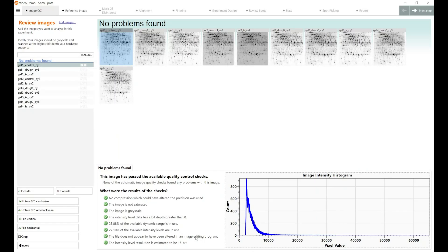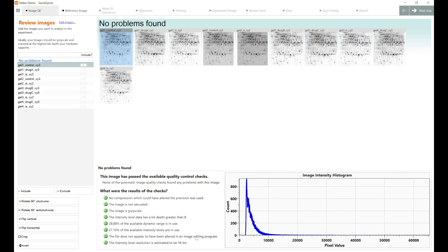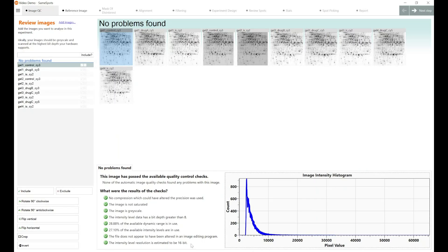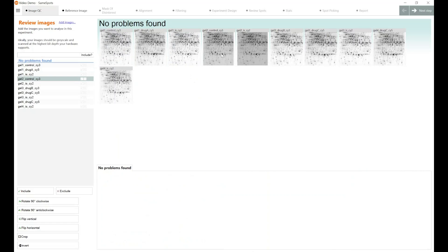SameSpots also checks to see if your image has been altered in an image editing program. This ensures that only the raw TIFF files have been used in your analysis. It means that if you try and use any image that's been doctored, SameSpots will detect that and warn the operator here at this step. And relating back to bit depth, the intensity level resolution is estimated to be 16-bit. I know these images are 16-bit. So I expected that to be green. As you can see, for all of the quality control elements built into SameSpots, these images all pass.